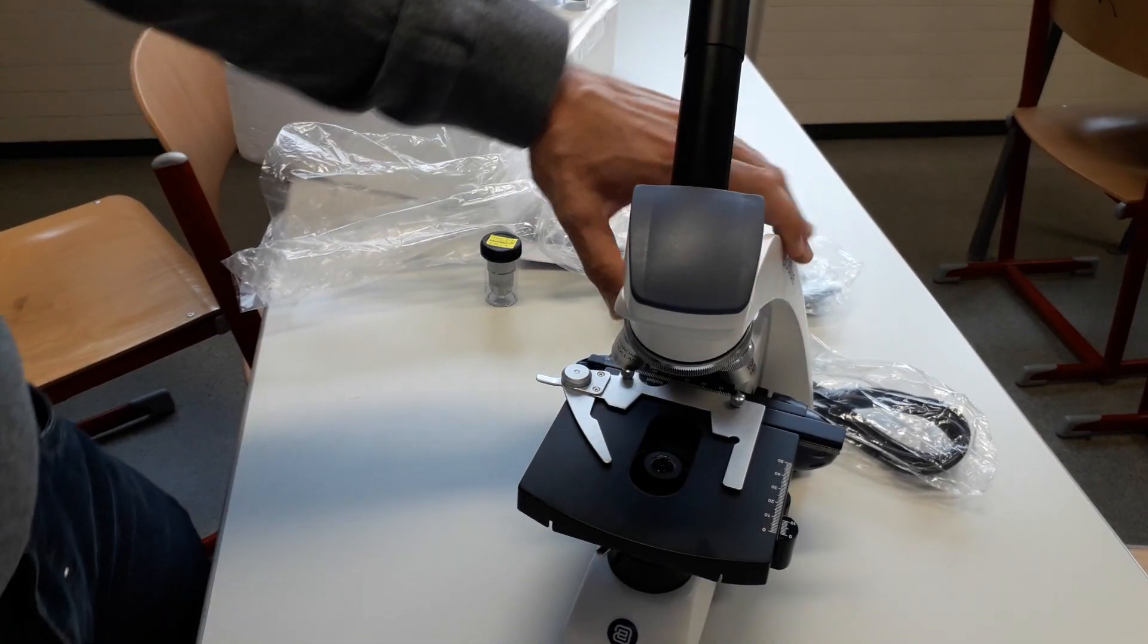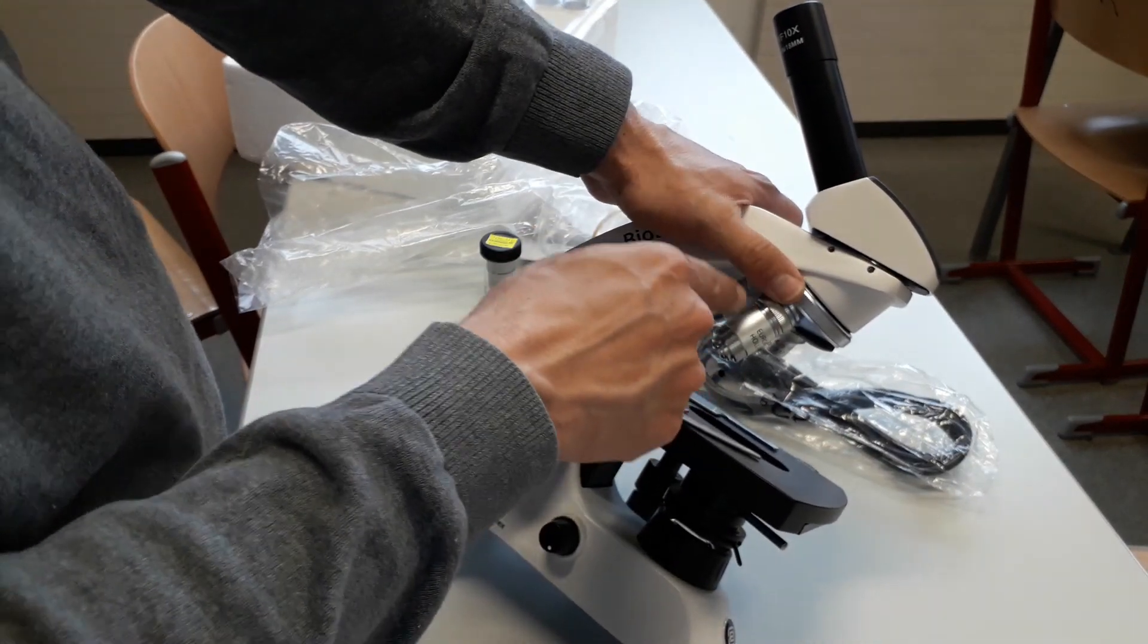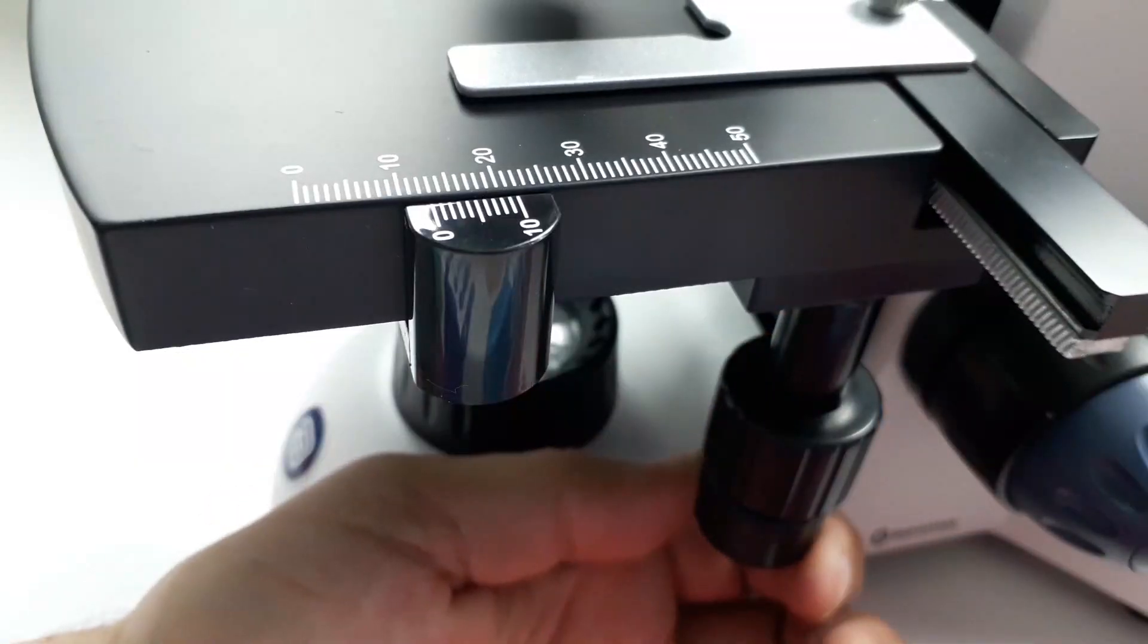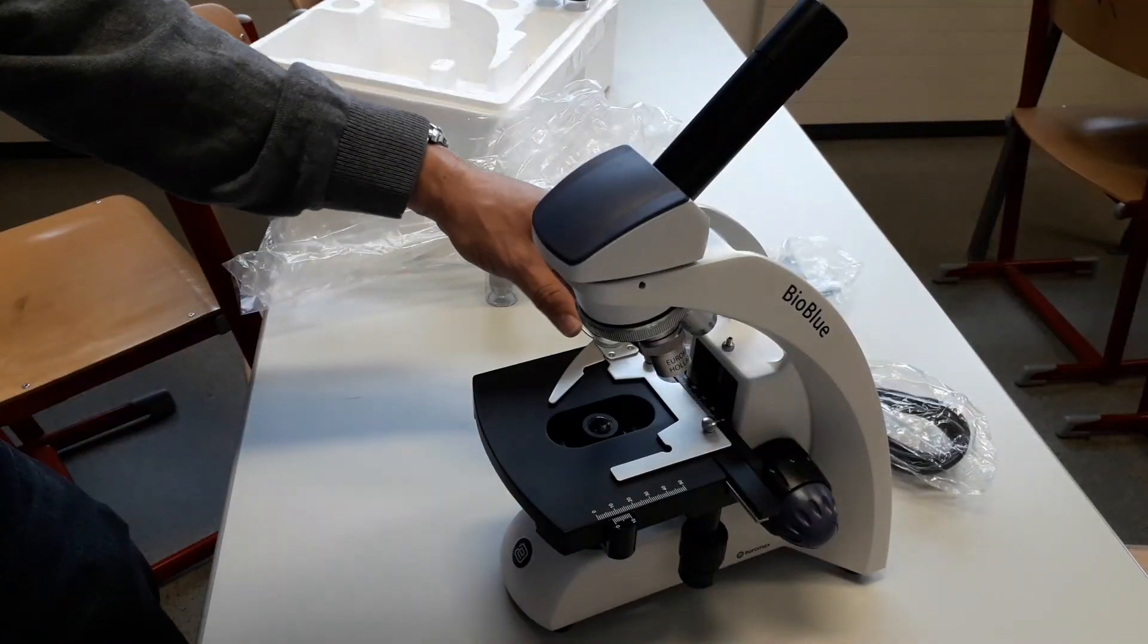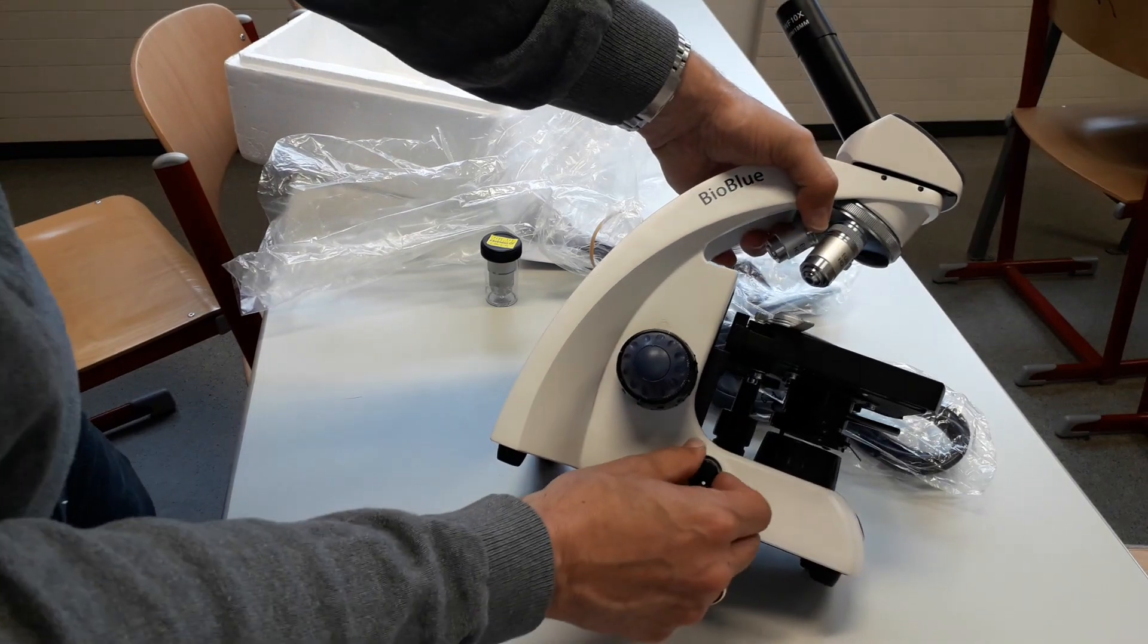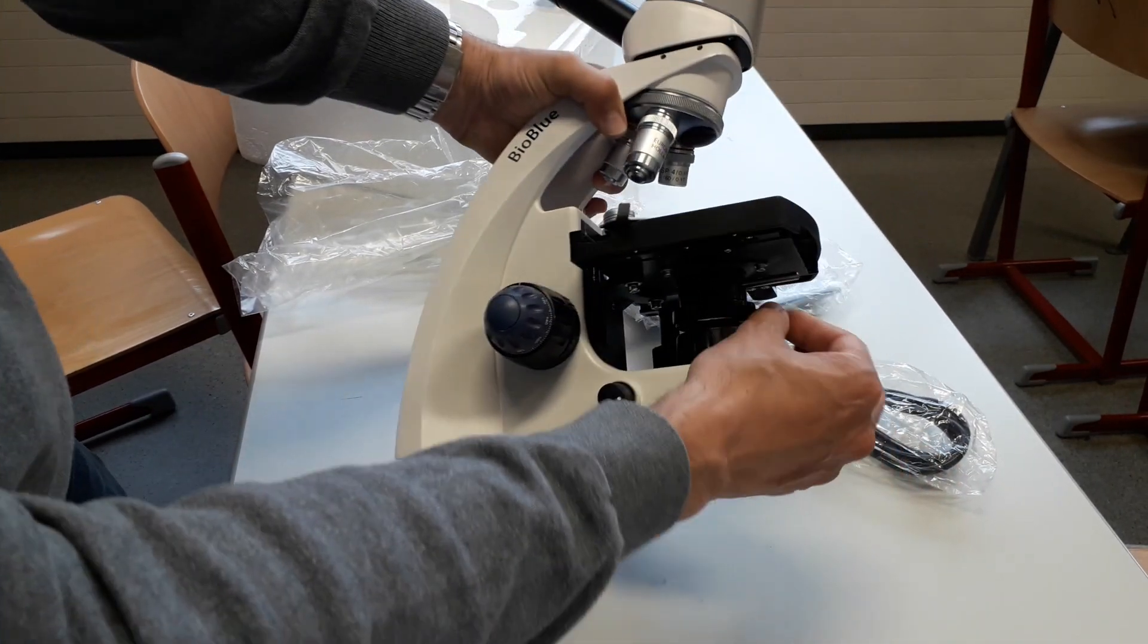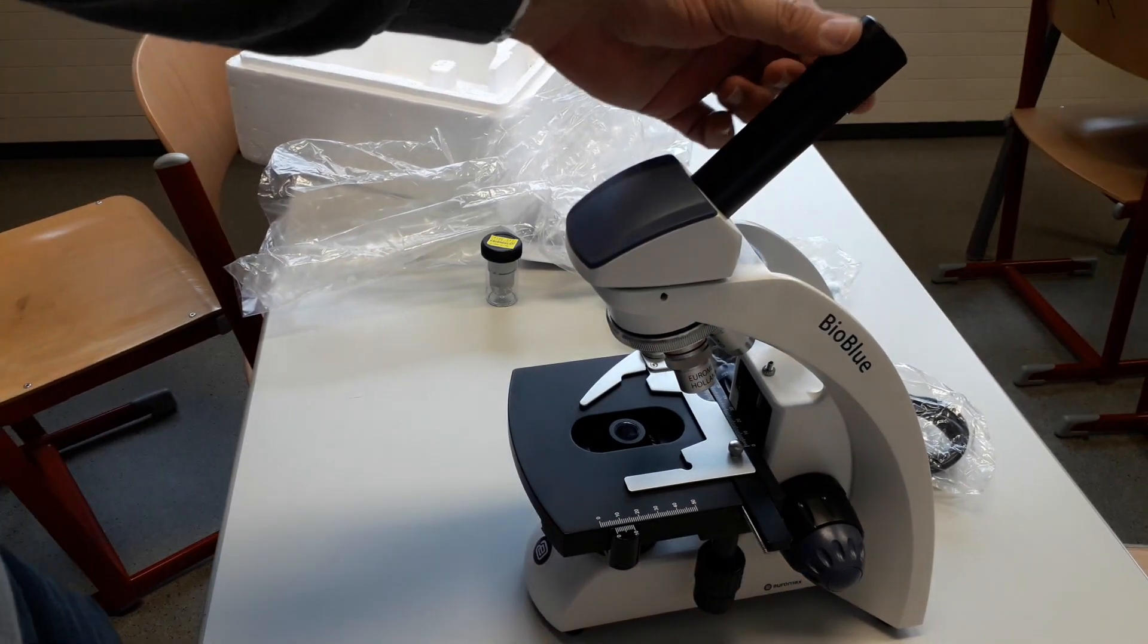Coarse and fine focus knob, of course. This is important. It's actually quite okay. It's not too heavy. Looks nice. Honestly, it really looks nice. I know these objectives actually, because we've got another microscope which has exactly the same objectives. We have the mechanical stage here. I like that the scale is clearly visible. Looks very nice. Honestly. Down here, we have the light intensity regulator, the condenser can be raised and lowered like this. Condenser diaphragm is here. Actually, I'm quite convinced. Look, student proof. It's not possible to remove the eyepiece that easily.